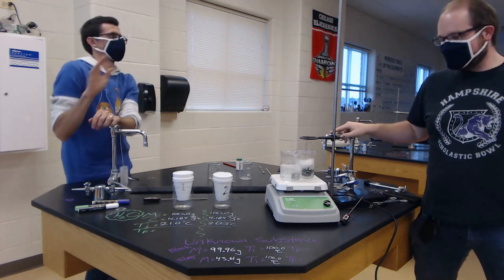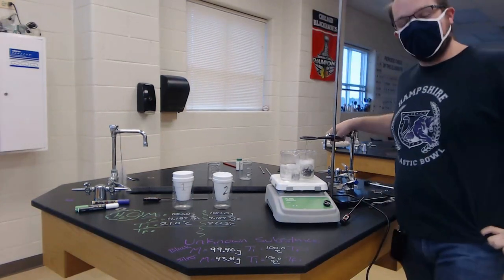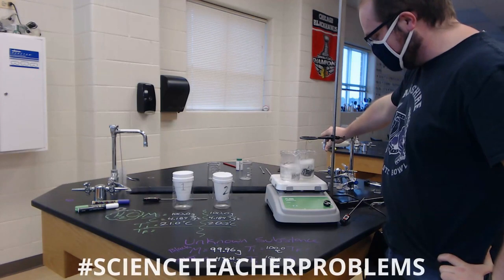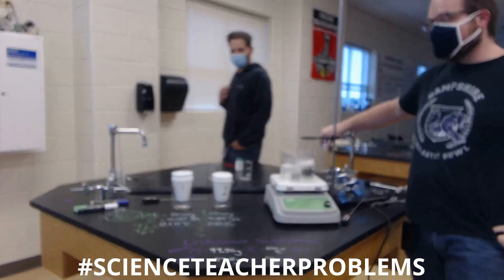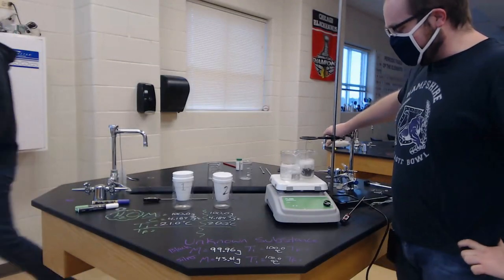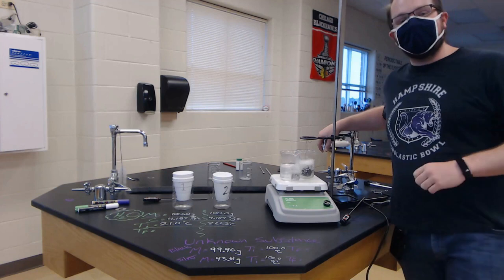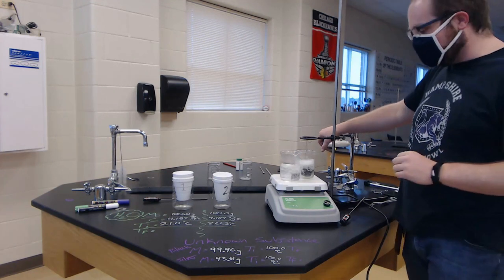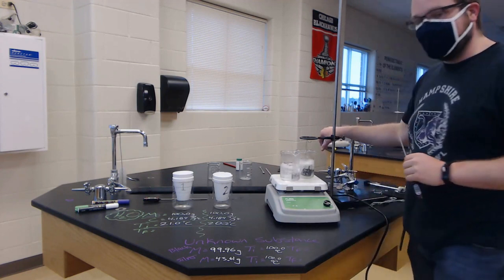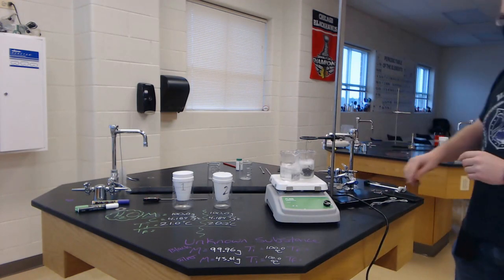So let's take a look at what we got here. I've got some unknown metals boiling in some water. Luckily we understand thermochemistry and we can use our knowledge to help us understand what metals they are, because they each have unique specific heats. Right now the water is at a hundred degrees, which means our metals in the water are also at a hundred degrees.